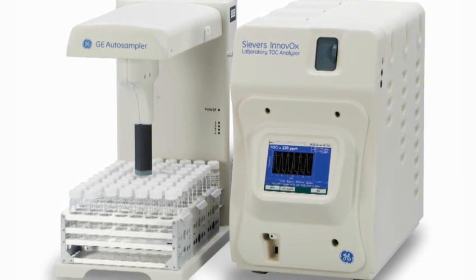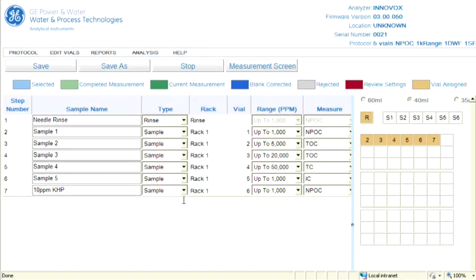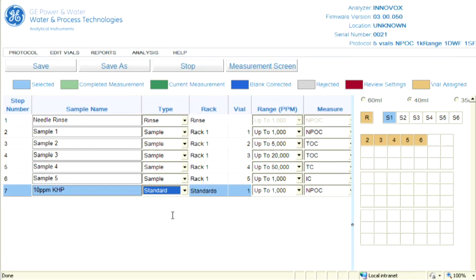If you are using the GE Auto Sampler, simply connect the Innovox to your PC or network, launch Internet Explorer, and start setting up your protocols.